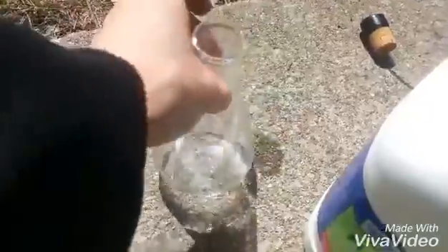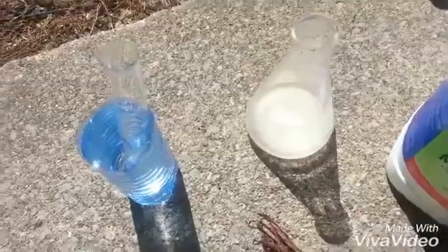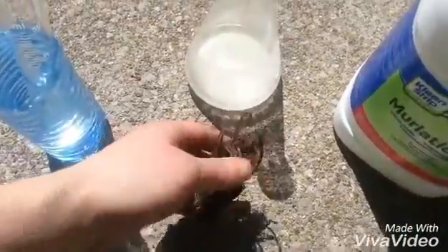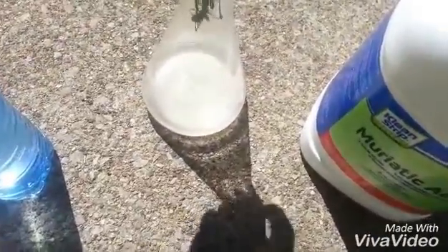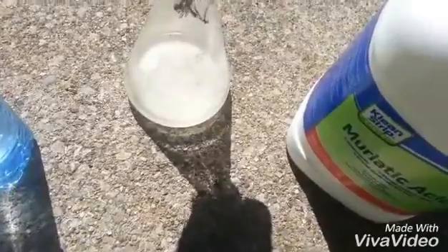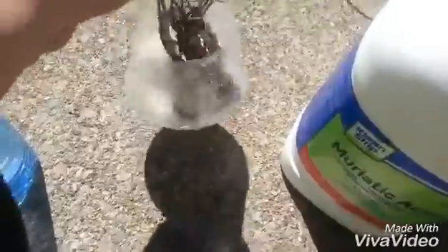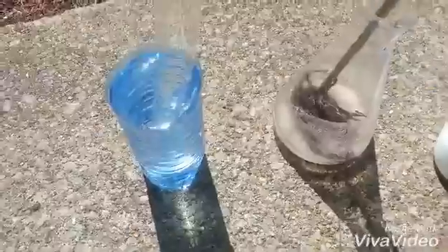And I will take 50 milliliters of water and dissolve in 60 grams of potassium nitrate. After the potassium nitrate has dissolved, or most of the way dissolved, I will add 34 grams of copper. So I'll just fit this in there. Get it to fall down on its side if I can. Use this little metal rod here.